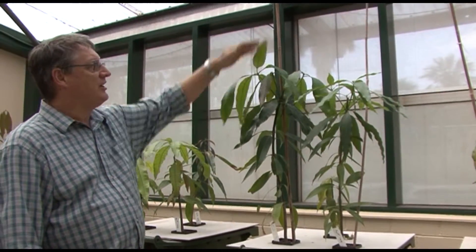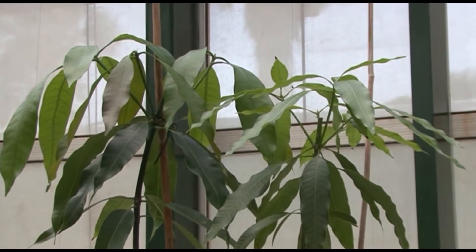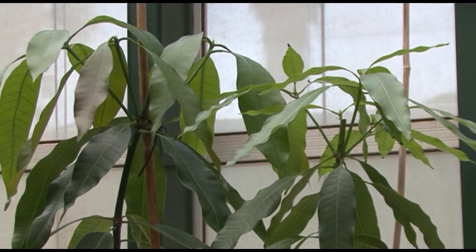The mangoes grow very quickly. These have already grown up to over a metre high within six months, and in the future we'll be able to look at grafted plants to examine the effect of grafted plants on rootstocks. Potentially, if you wanted to look at the effect of rootstocks on growth patterns of trees, instead of doing long-term field trials we can very quickly screen the trees in a system like this.